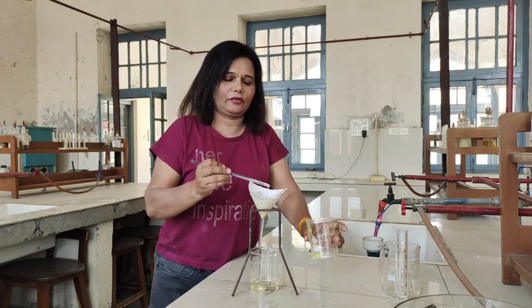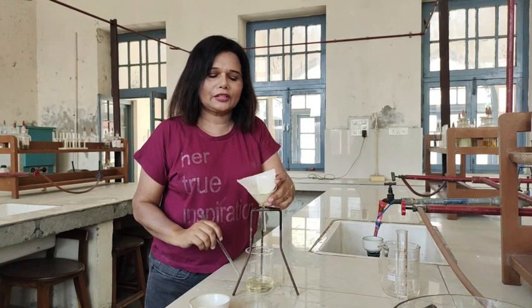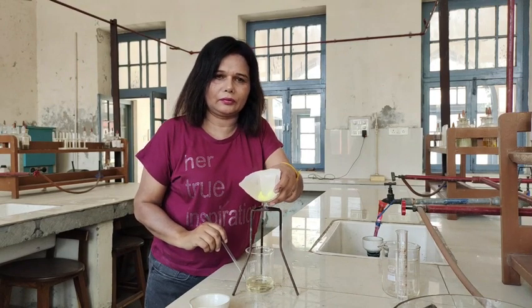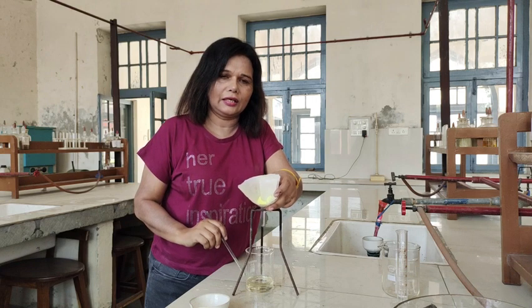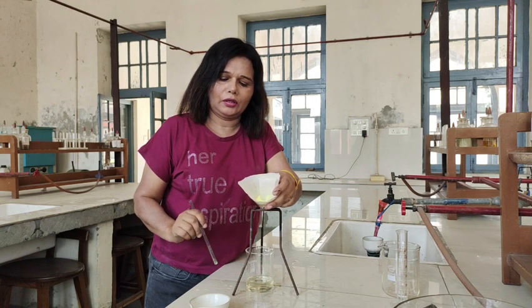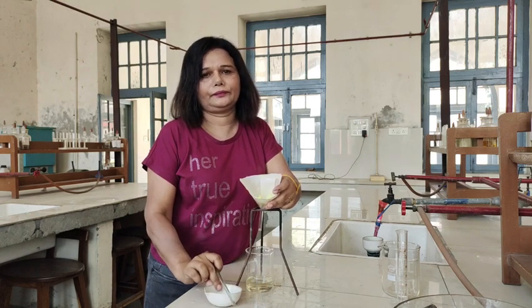So in this way, we'll do the filtration. Now see the residue over the filter paper. Now we'll transfer this residue of crude mass of iodoform to the china dish.